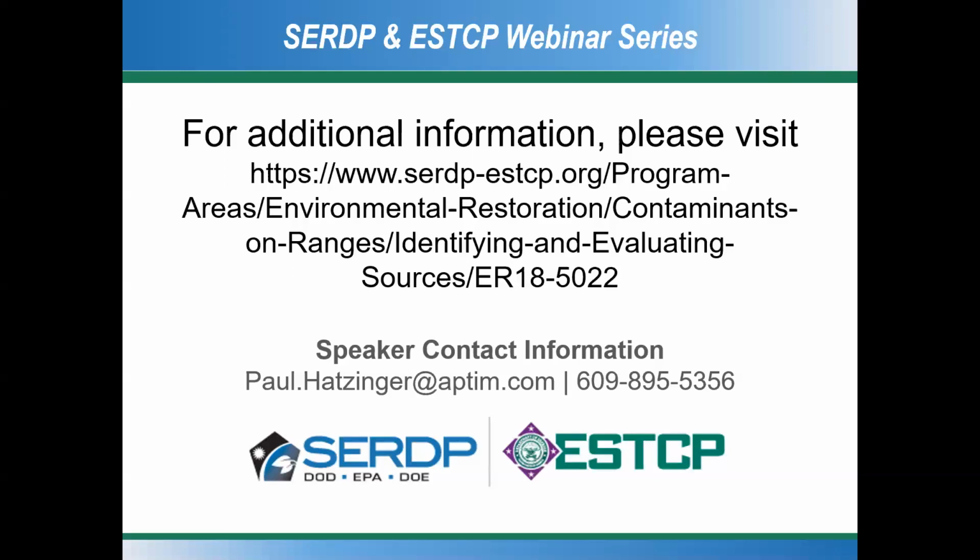We have a whole slew of new questions for you, starting with this one. In your experience, at approximately what percentage of sites does CSIA provide degradation or rate information? And how would a user know if CSIA might be worthwhile?